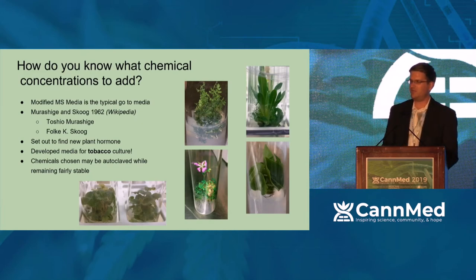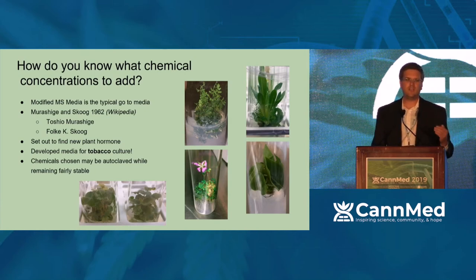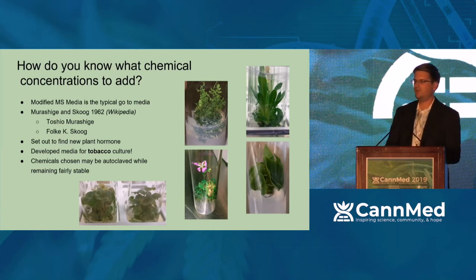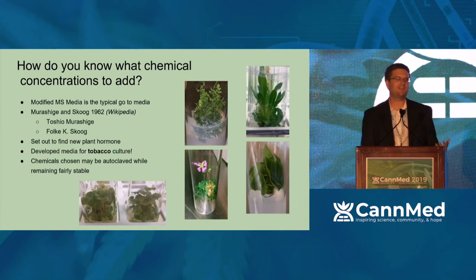So when you put it in this media, sometimes these plants are lacking nitrogen, or other hormones that you'd expect, and they're just not there. And that requires each individual cultivar to have a specific protocol made for it. I can't stress that enough, because in every other aspect of the horticulture industry, you'll see Scutellaria baicalensis and Scutellaria orientalis, or different species such as those, that require different hormone and nutrient blends. But most people, when we talk about cannabis tissue culture, want to do a one-shoe-fits-all and hope that it works out with just one protocol. And I've seen too many times where that's not the case. You'll develop a protocol, it works with one species, not another.